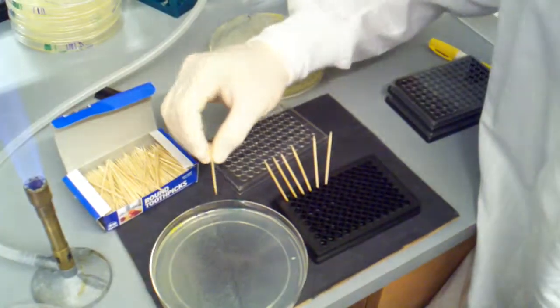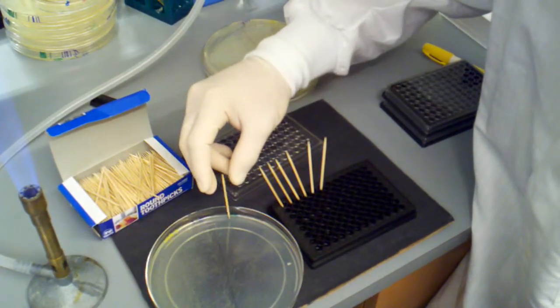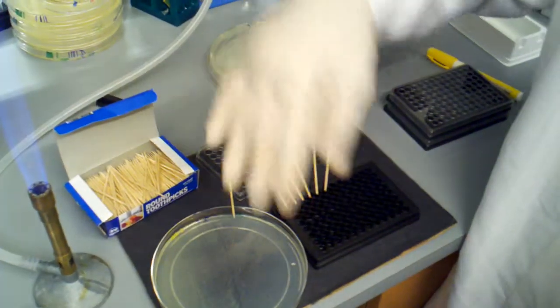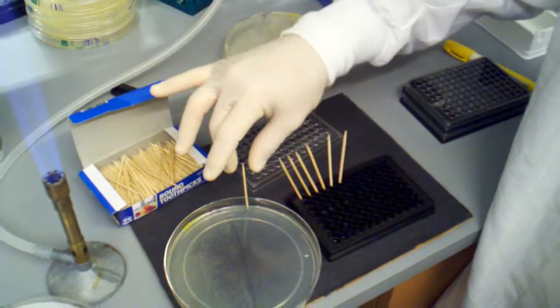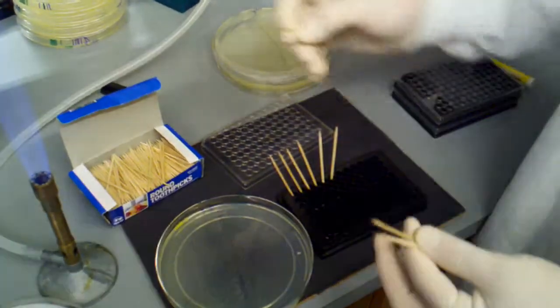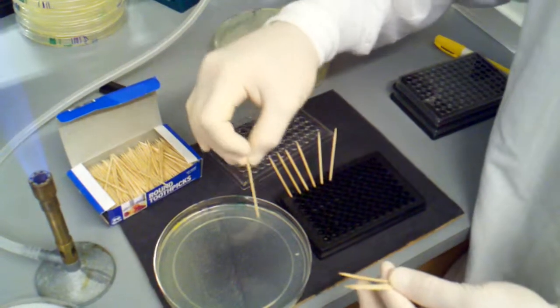But sometimes if you stab it, the toothpick will stand up, and you can stab a bunch of colonies. You get like 10 toothpicks on there, and then you can pull them out and inoculate your well. But this plate, the agar is a little bit too thin.